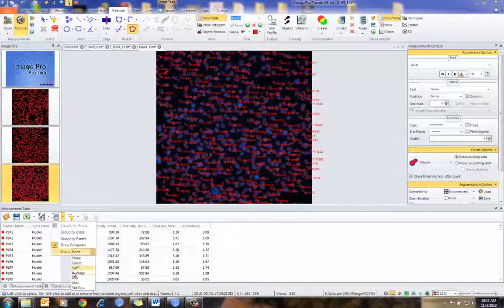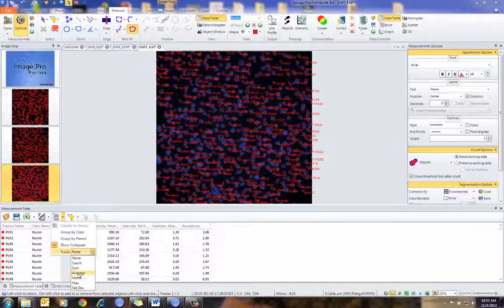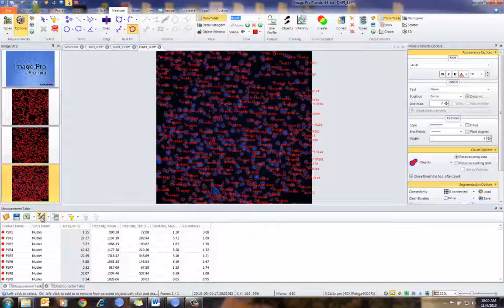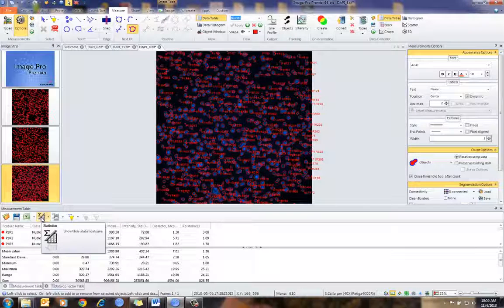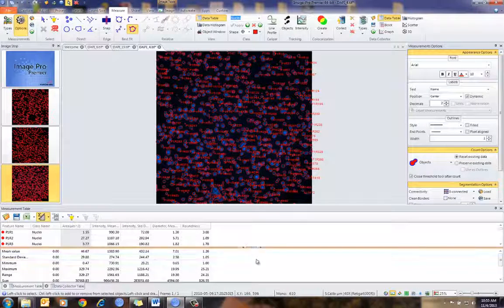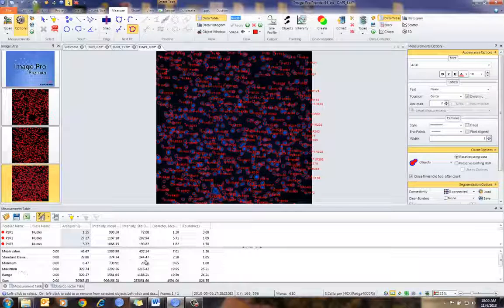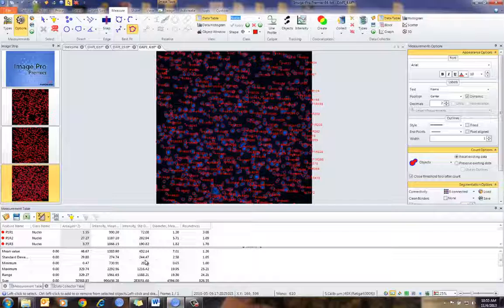I can show various information such as averages and standard deviations for the various measurement parameters I've counted. And I can also, by pressing on the statistics button, show and hide the statistics panel, which will generate the statistics for all of the images together.